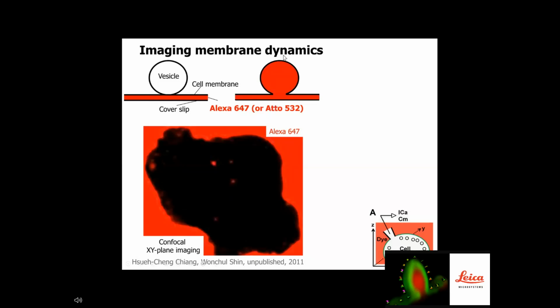And when vesicle fusion occurs, this fluorescent dye can then diffuse into the fusing vesicle, so we can see a spot coming after the fusion. To induce fusion, we patch clamp the cell, we give a depolarization, 1 second depolarization, and that causes calcium currents and capacitance increase that reflects exocytosis and decay that reflects endocytosis. So I'm going to play a video of this process. So at the beginning, there will be nothing here. It's a resting condition. Then we give a depolarization. You will see the spots come in because of the fusion. So right now, start.